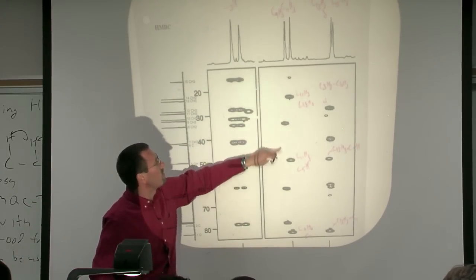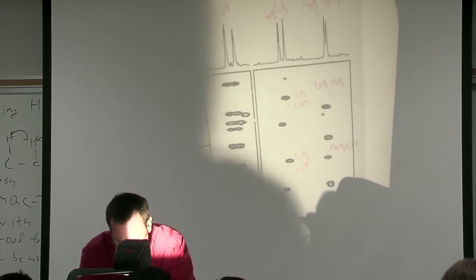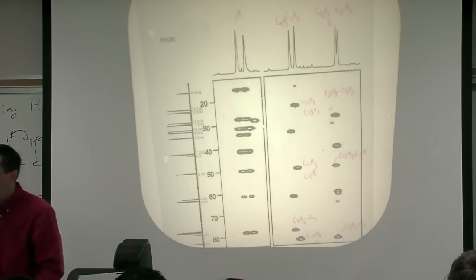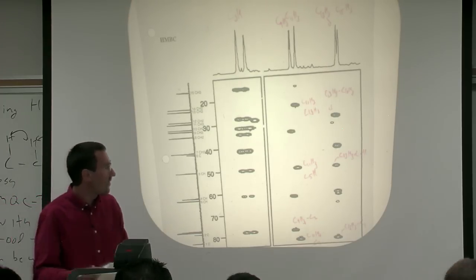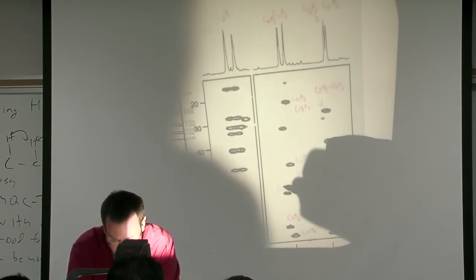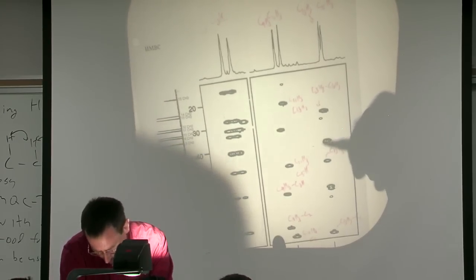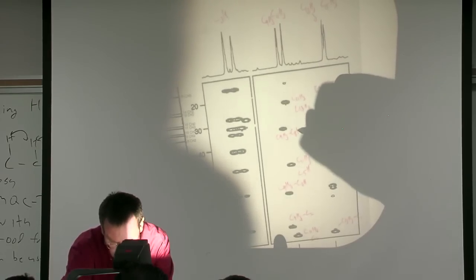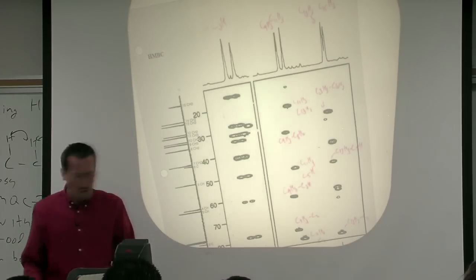But let's go ahead and we'll come off of C9 here. C9 will be interesting. So over here we've got C9H3 to C2. That's useful. So we've got an isolated methyl, and it's off of another quat, and that quat is C2. And then let's see what else we have for it. We have C9H3 off of C3H, rather. OK, that's kind of useful. And we have C9H3 off of C8H2.